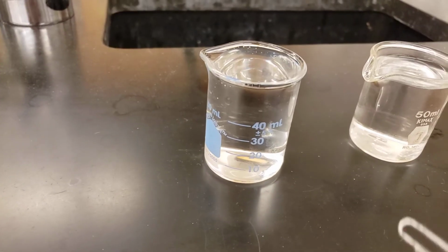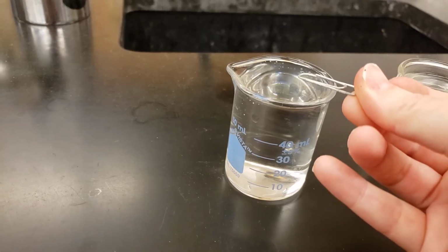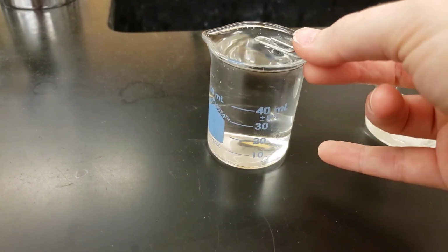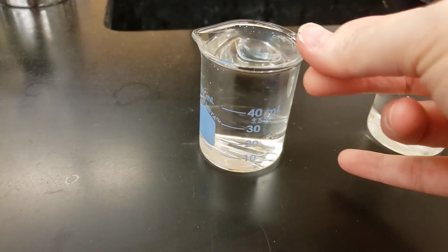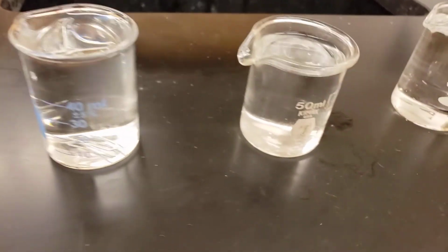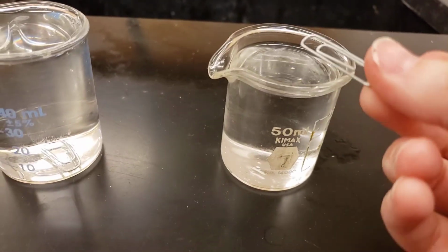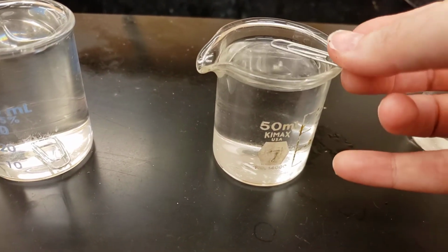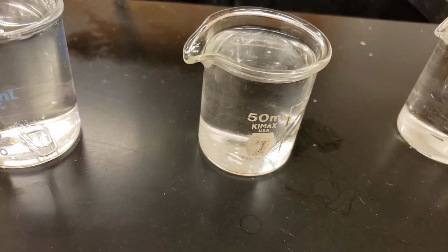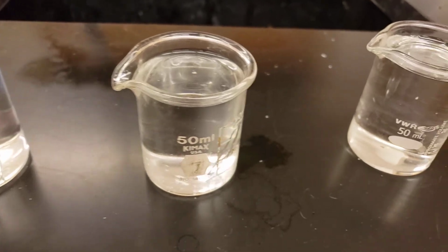So up first we have our water. And we're going to really carefully try and get that paper clip to go in there. And we see that it won't and that it sinks. When we move over to our alcohol, we're going to try the same thing. And it sinks even faster than the water did.